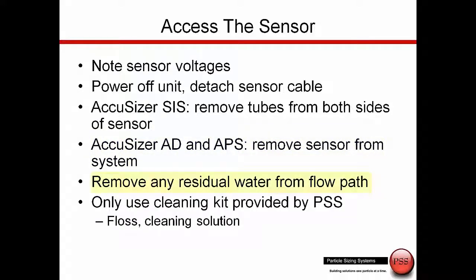Remove any residual water from the flow path, either by using a syringe or using another clean air source. Please use only the cleaning kit provided by PSS, which includes the floss and the cleaning solution.